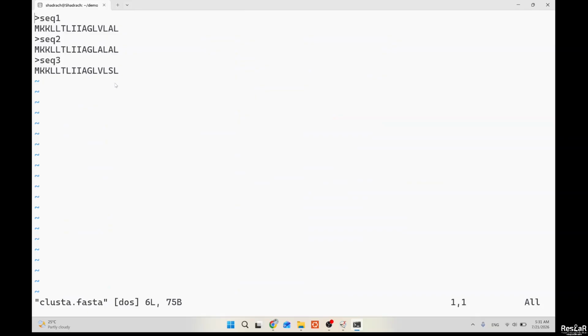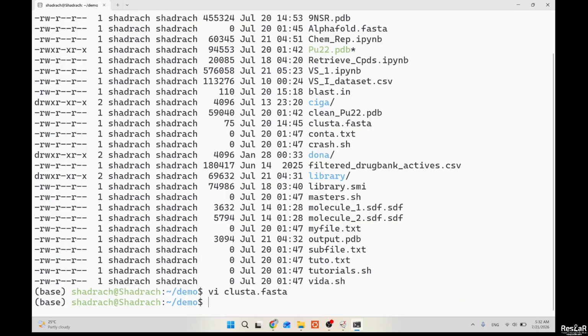Multiple sequence alignment, as we mentioned, is a pairwise alignment for each residue or nucleotide in our sequence across all the sequences. So it's a whole lot of work, especially if you have a lot of sequences. But for now, we're just going to look at these 3 sequences. We're just going to use a program which I've shown you during the course to do that. We're going to use ClustalW.